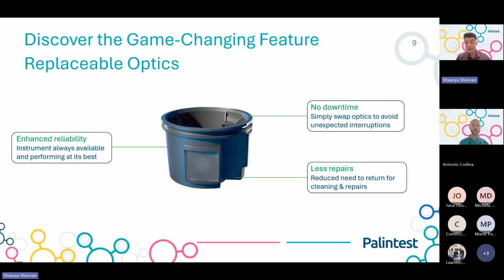There is a previous webinar we did 2 months ago where Lauren demonstrated how the optics come out. So you can always refer back to that session for the procedure to take the optics out.